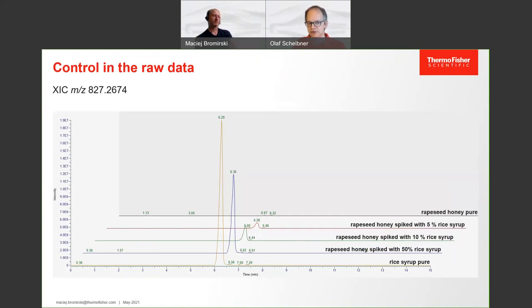And this was not very much of doing. Compound Discoverer gave us this result very easily without much ado.